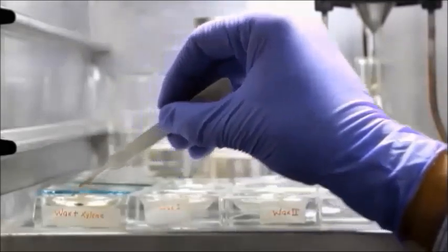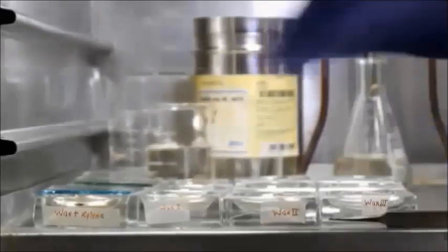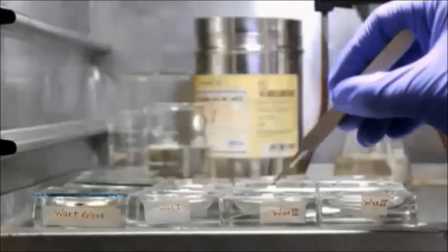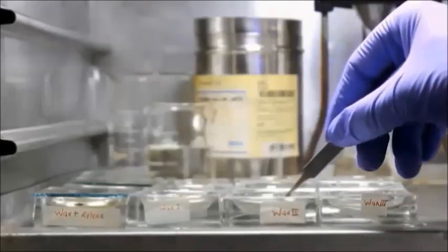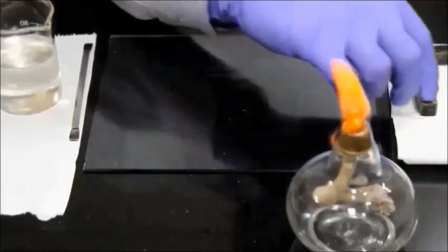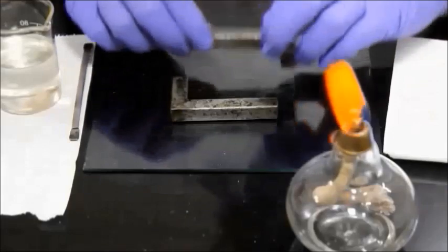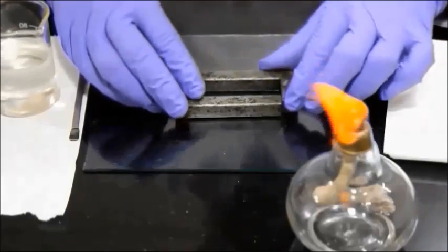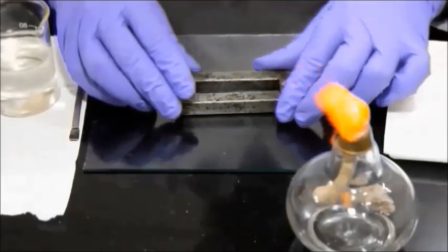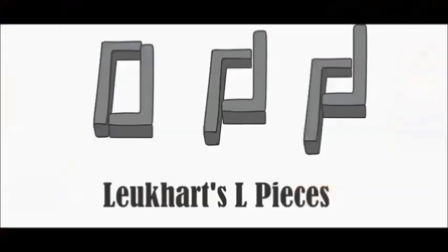Tissue is kept in xylene and wax mixed 1:1 for 10 minutes. Later, 3 changes of wax are given with an interval of 10 minutes. By using Leuckart's L pieces, the tissue is oriented in molten wax, which is called embedding of the tissue. These L pieces are arranged according to the size of the tissue.